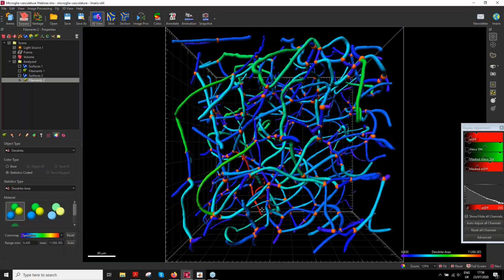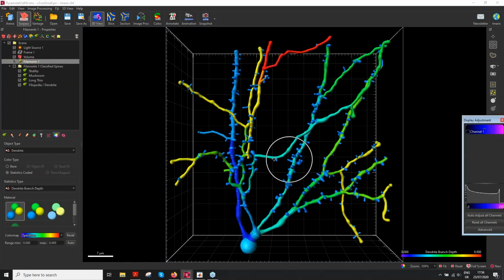Yeah, sure. So I hope that everybody can see my screen. I should be sharing it at the moment. Okay, so I guess we are more focused here on the autopath algorithm, and essentially the seed points are points that we add along the filament that we want to segment, and we add them based on the intensity information. They are really necessary since the autopath algorithm will use them to create the shortest path.